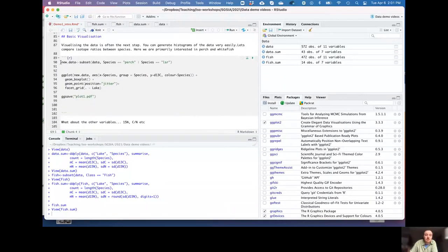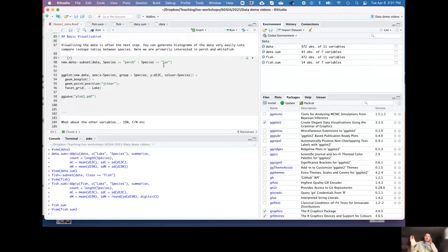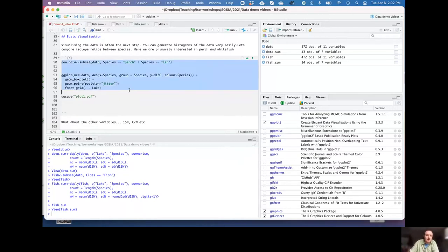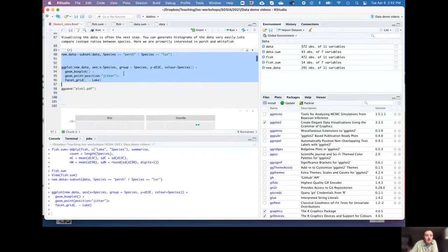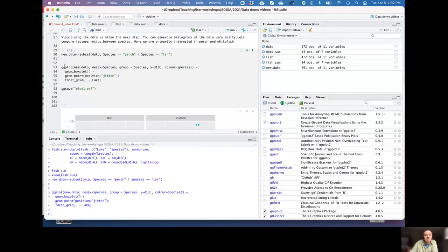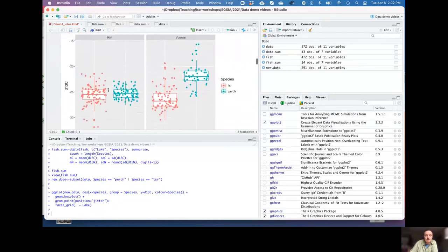We're particularly interested in two species — perch and whitefish — and how their isotope ratios differ relative to each other in these two lakes: one deep and one shallow. We subset the data where species is perch or LSR, then plot it in ggplot with species on the x-axis, carbon isotope ratio on the y-axis, grouped and colored by species, as a boxplot.